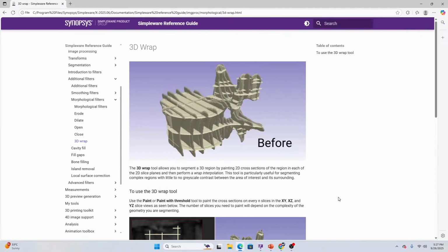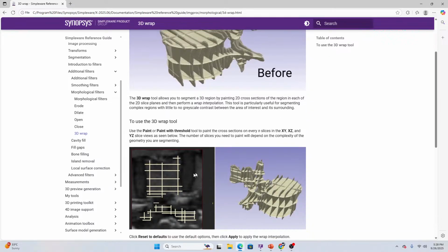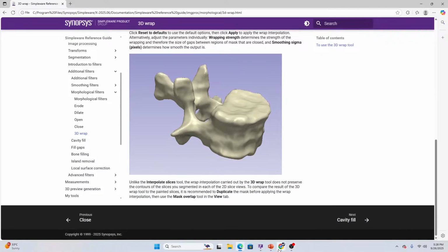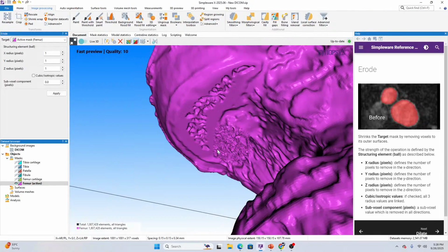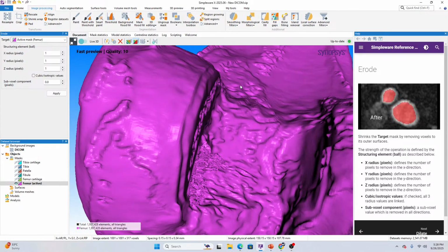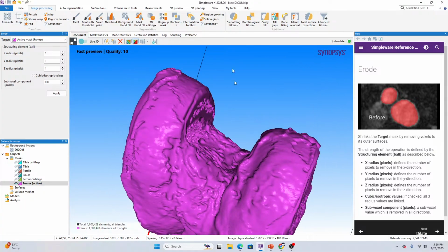So here we also have a 3D interpolation tool. For example, if we need to do proper interpolation between the slices, this 3D interpolation tool can also work for that. So this is how it basically works around basic image segmentation techniques. These are the basics of ScanIP.